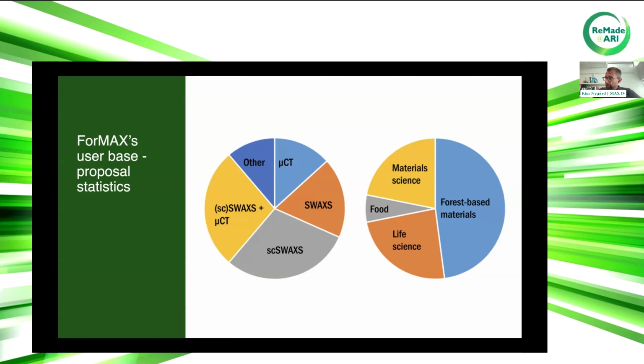Given our funding scheme, it's no surprise that roughly half of the proposals we receive are for some development of new wood-based materials. But then we have roughly 1/4 on life science, to a big extent biomedical imaging, and that is to a big extent scanning SWAXS imaging.